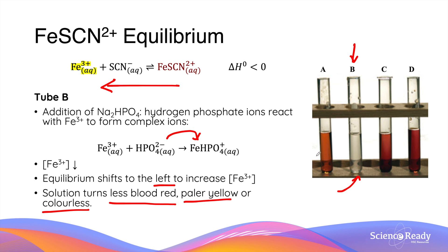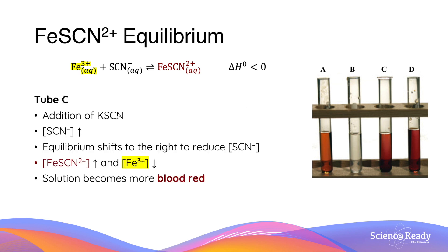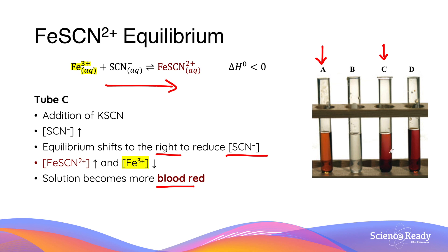Comparing test tube B to test tube A, the reference control, test tube B has a much paler or more transparent appearance. Adding more potassium thiocyanate increases the concentration of thiocyanate ions, which shifts the equilibrium to the right in order to reduce that concentration. As the equilibrium shifts right, the concentration of iron thiocyanate increases while iron 3+ decreases, causing the solution to become more blood red. Comparing test tube C to test tube A, the blood red appearance is slightly more intense and darker.